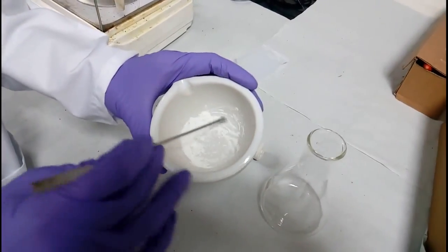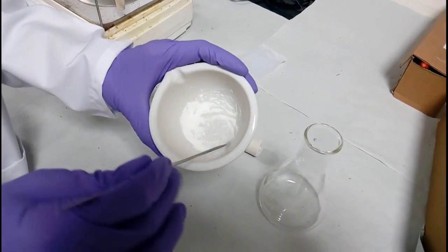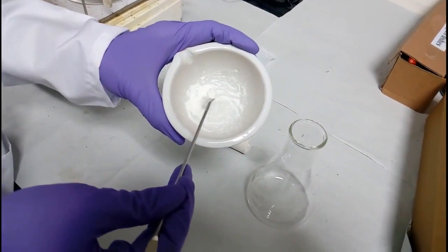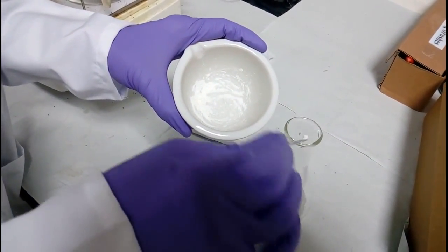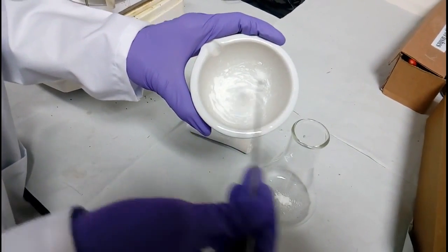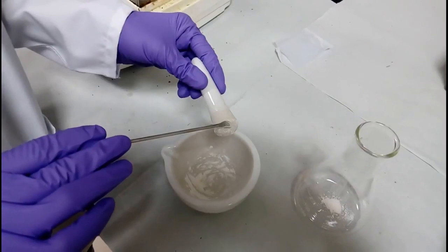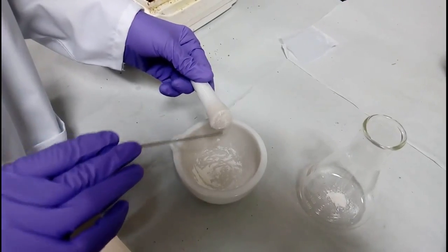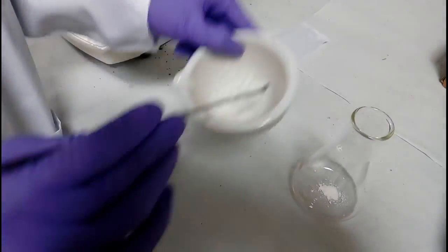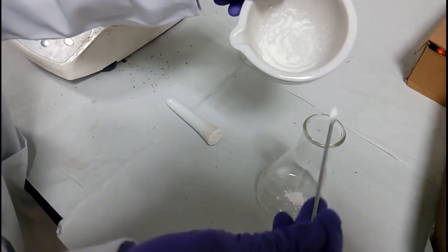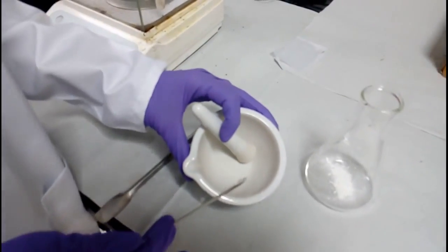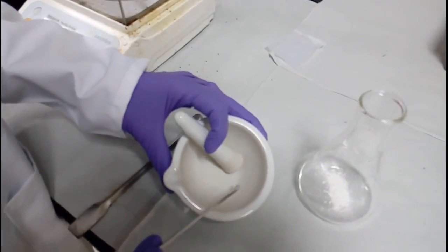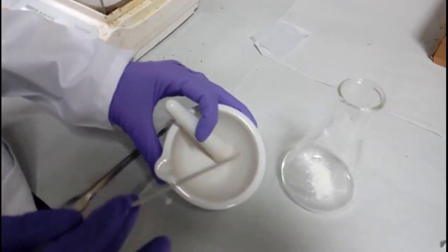Transfer this fine powder to a 250 ml conical flask using a spatula. Make sure that the complete powder of the tablet is transferred into the conical flask.